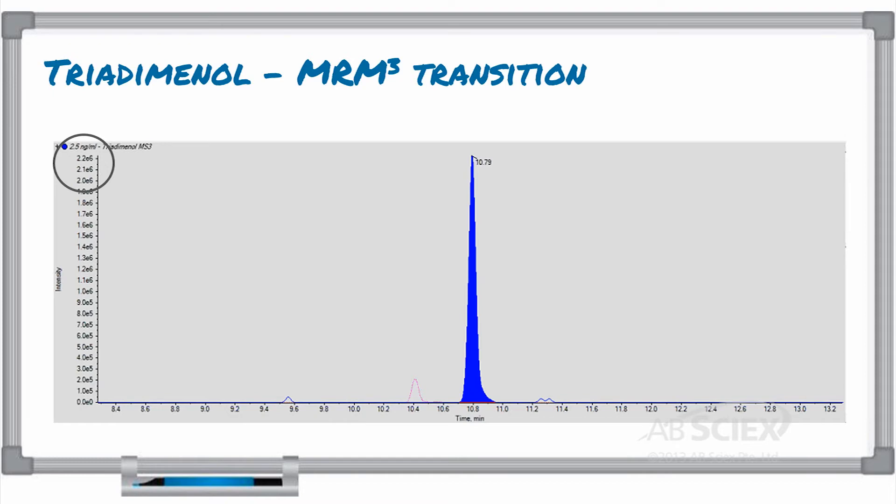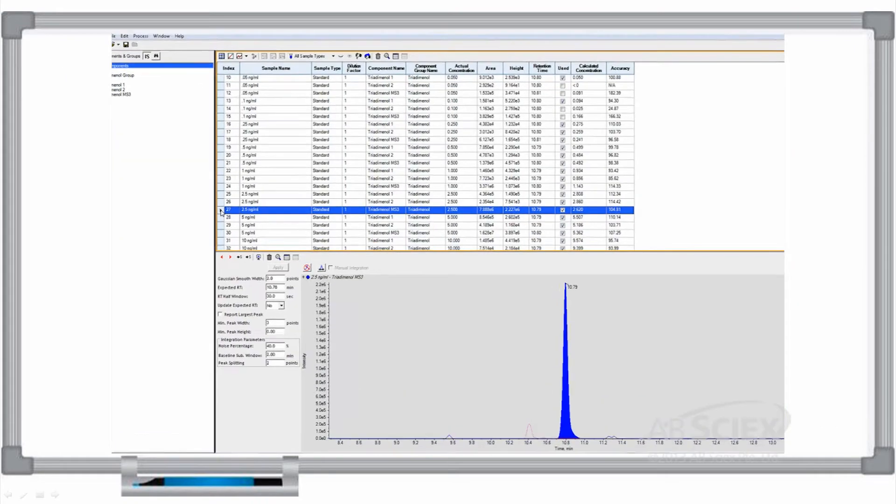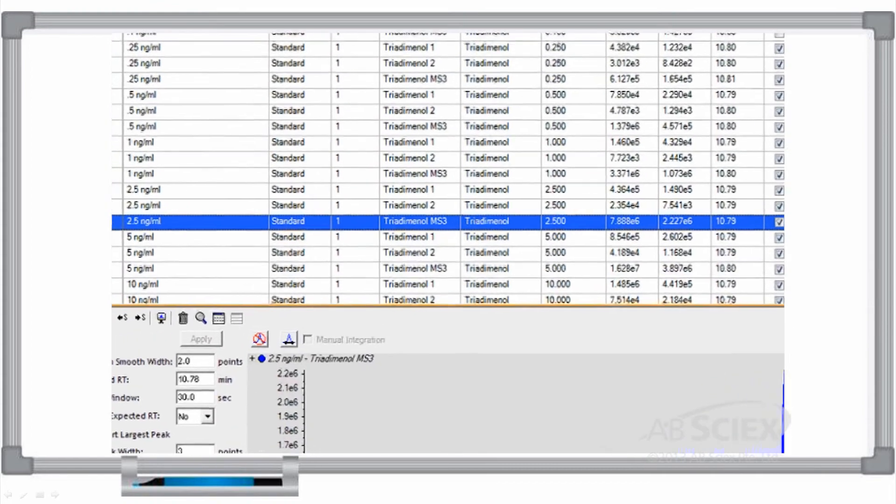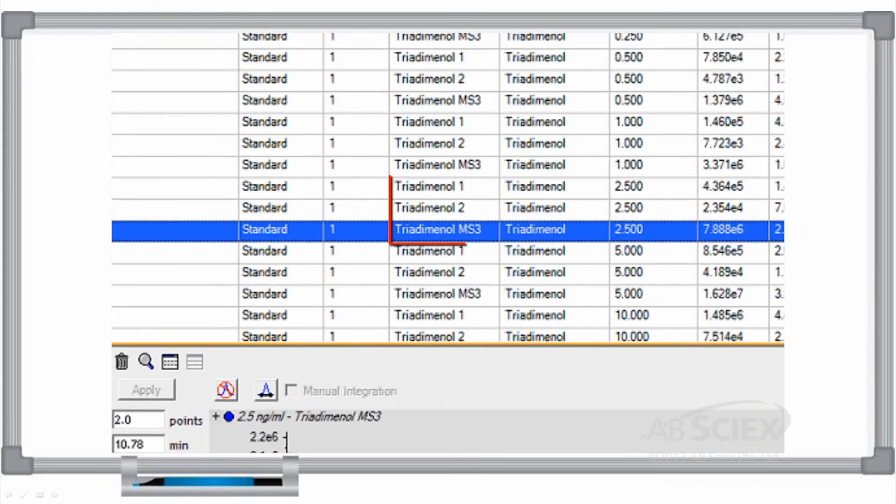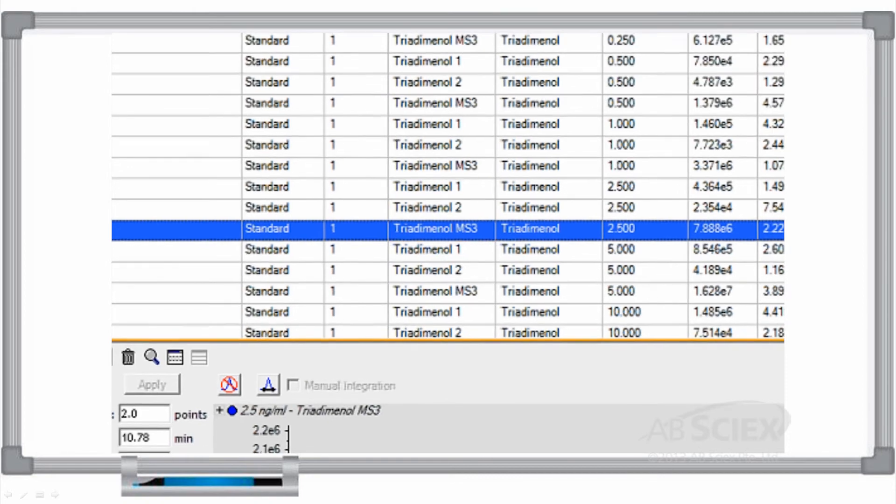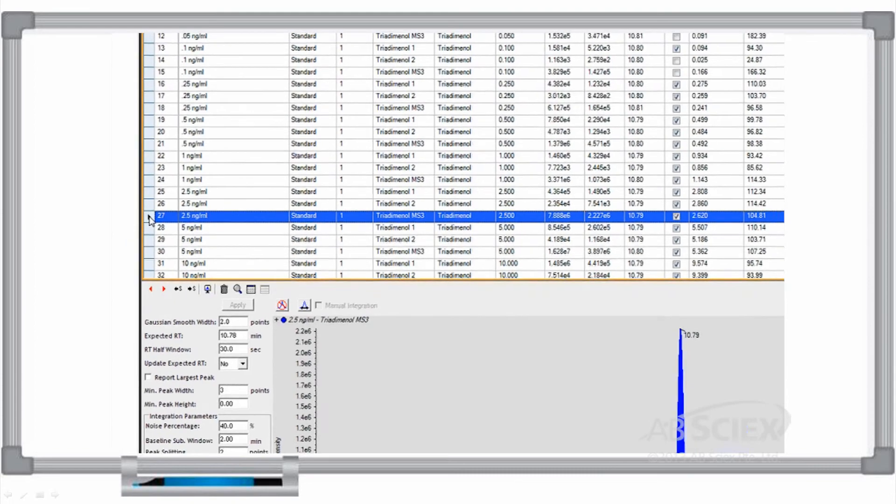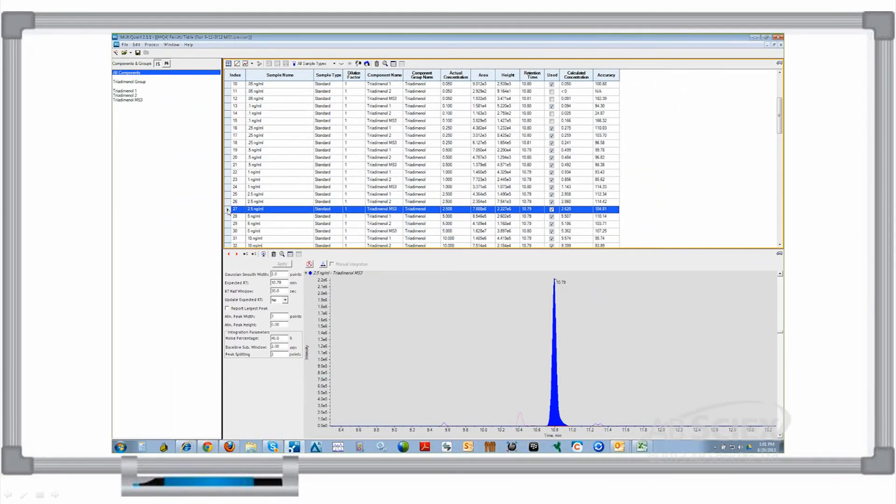Keep in mind that these MRM-cubed data can also be used to perform quantitative analysis. In the example of triadminol, we monitored two MRM transitions and one MRM-cubed transition in our analysis. Here we show the multi-quant results table we created which contains the results for our batch for both MRM transitions and MRM-cubed transition, identified in this table as triadminol MS3.